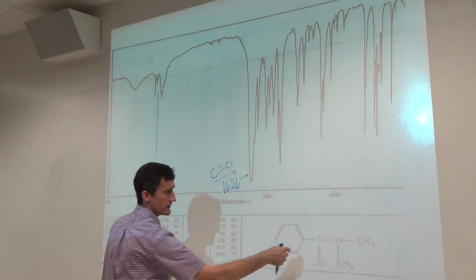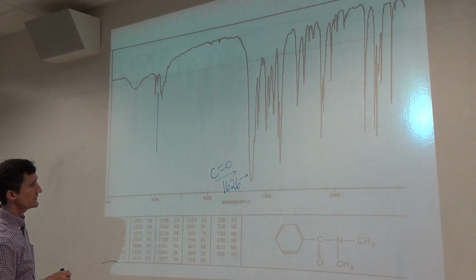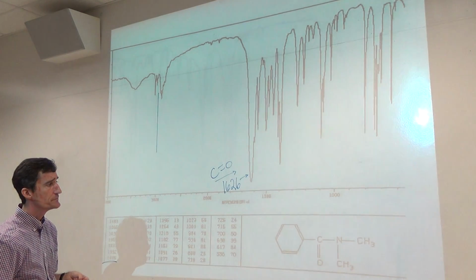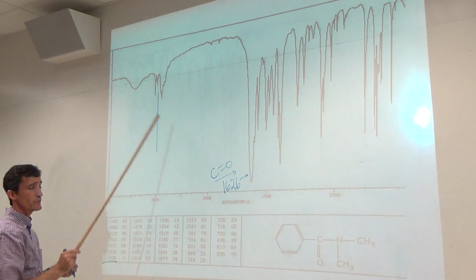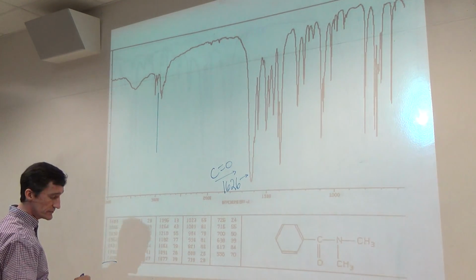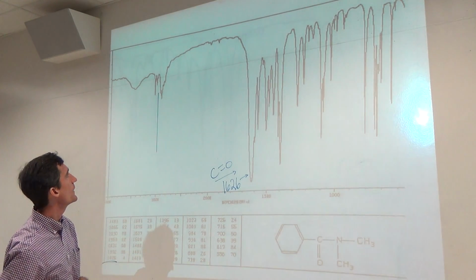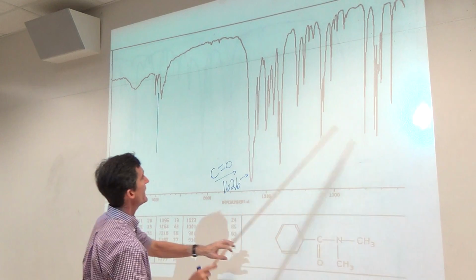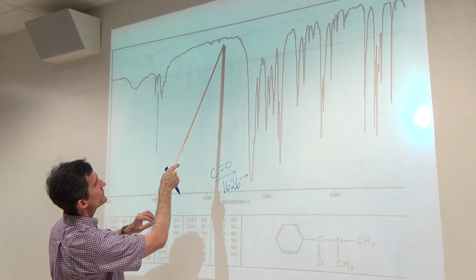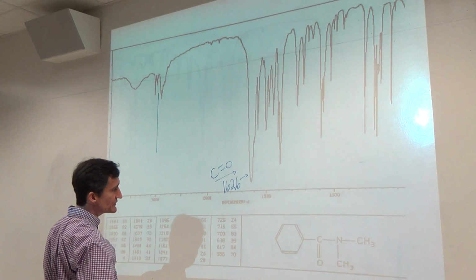What is this here? There's no NH in the structure, so we don't expect it. This is perhaps a little water. These are actual spectra. If you've got a little water in your sample, you will get some absorbance here for the water. Of course, water does have OH bonds. I'm thinking that's maybe what that is there. The rest fingerprint. We do have an aromatic activity in the 1600 regions. The aromatic signature is not that intense or almost absent. Sometimes that's the case, not sure why.